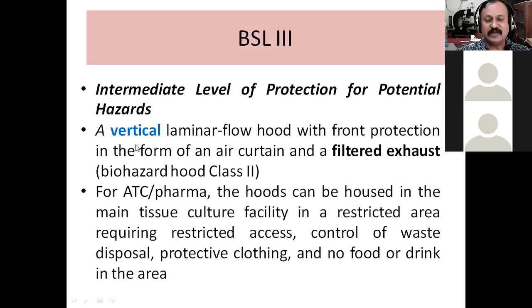This is essentially a vertical type of laminar airflow cabinet. Just remember this: for biosafety level 3, we use a vertical laminar airflow cabinet. This is called a class 2 cabinet, because there are certain additional features associated with this kind of laminar airflow cabinet.